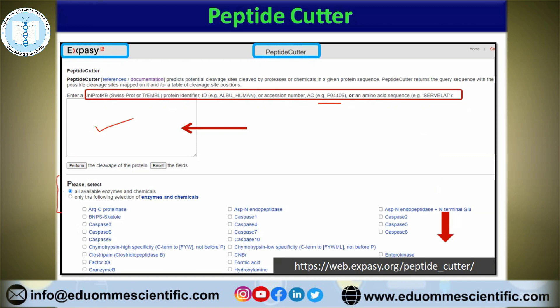If we come to the selections and settings part, either you may go for the default settings or choose your required setting based on your experimental needs. You may choose a single protease or chemical, a customized selection, or the whole list of proteases and chemicals. If your focus area is only one chemical or one enzyme, you can select only that one. Or if you are using three, four, or six enzymes and want to check whether they cleave your protein or peptide, you can do a customized selection. Otherwise, go for default settings and select the whole list.